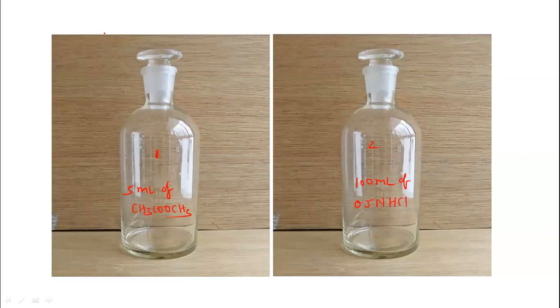This is set 1. So set 1 can be performed by taking 5 ml or 5 cm cube of methyl acetate, then in bottle number 2, we have to take 100 ml of 0.5 normal hydrochloric acid solution.